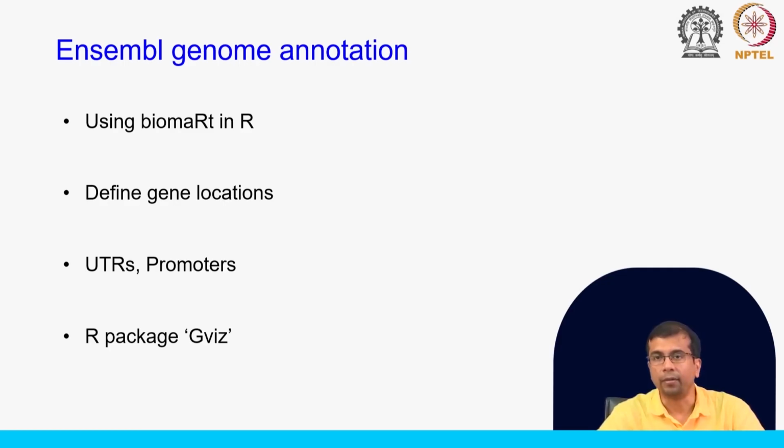Let us start now with the hands on. Let us go back to the bed files, and first load the data, then we will do the binning and the extension and peak calling. That is what we are going to do in this class.